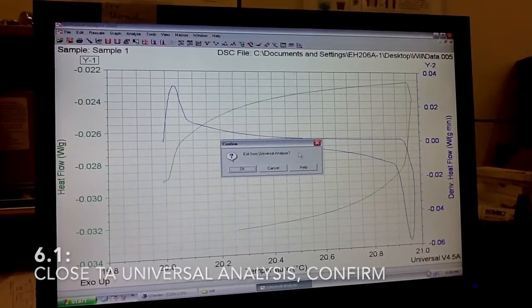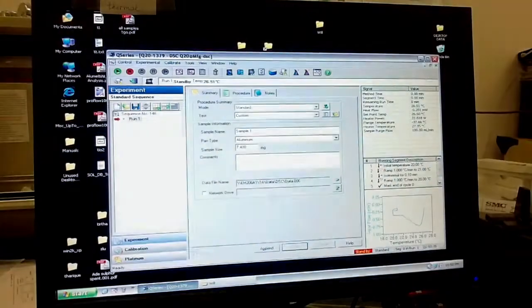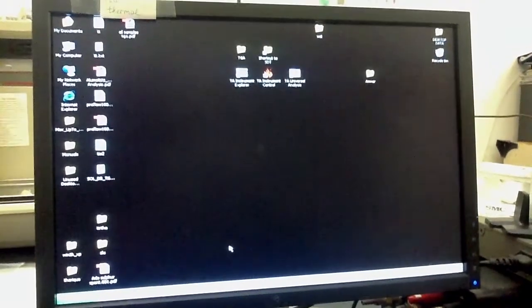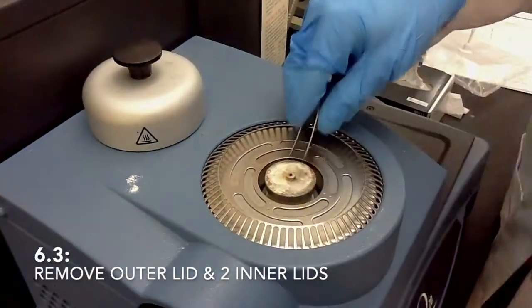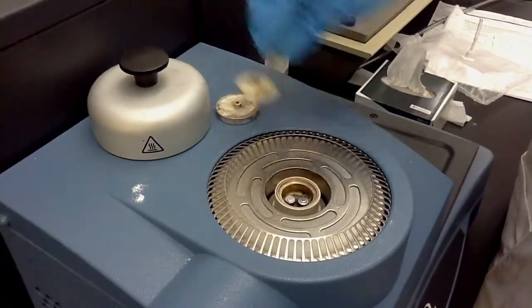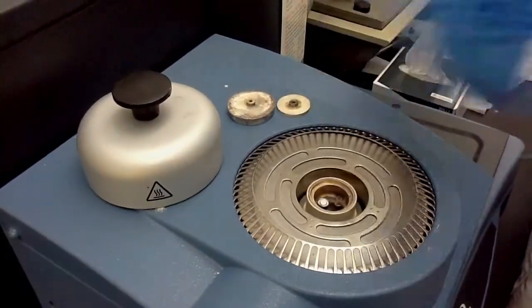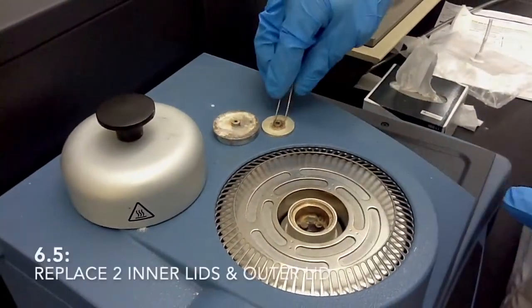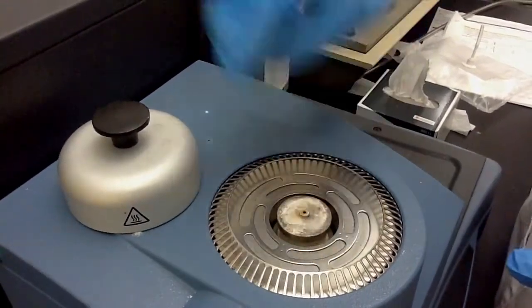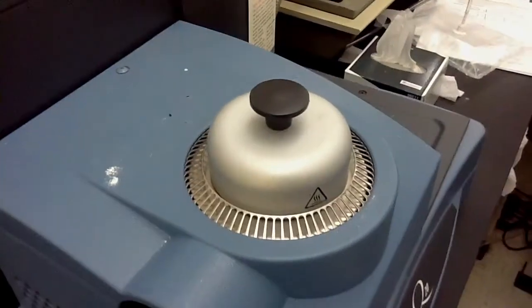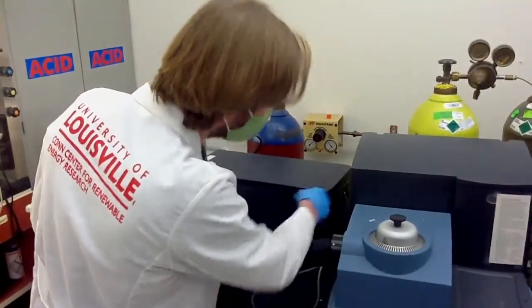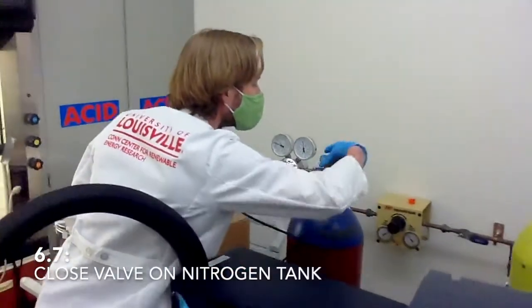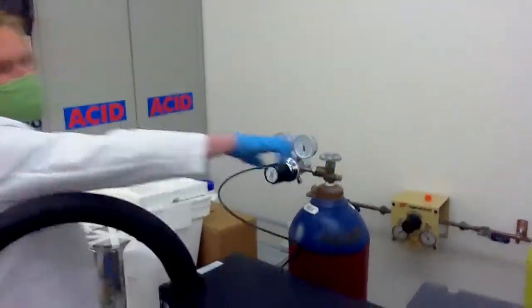When you are finished with everything, you can simply close out the software. You can take these back off and dispose of your sample. And put the tops back on. And finally, you just turn off the cooling system. Close the tank. That's it.